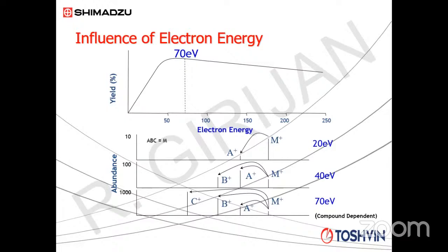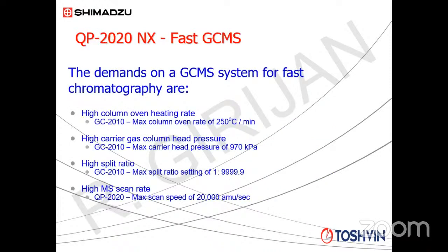This is a feature given in the software called variable ionization voltage facility, and it is given by most of the manufacturers. Okay. Now, fast mode of analysis, I told you how we can reduce the analysis time and increase the output. This is the requirement in the corporate world. Now to do this fast mode of analysis, there are certain hardware requirements.